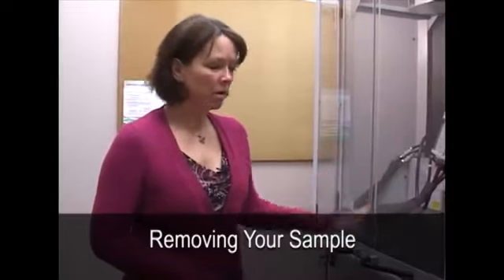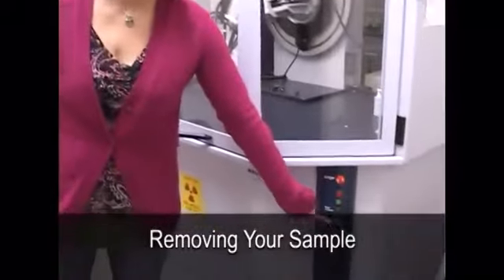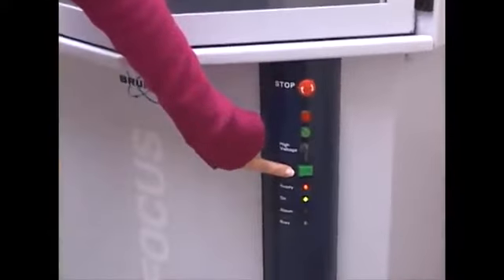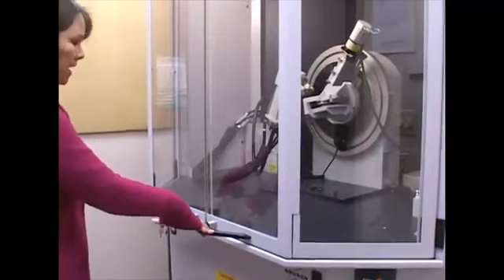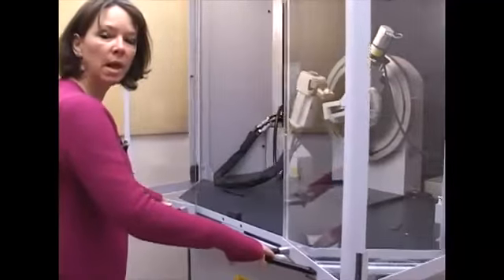So to open the door, there's a big square open door button here. It's the only button you ever want to push. Press it, the alarm light starts to flash, pull the handles out towards you and away.